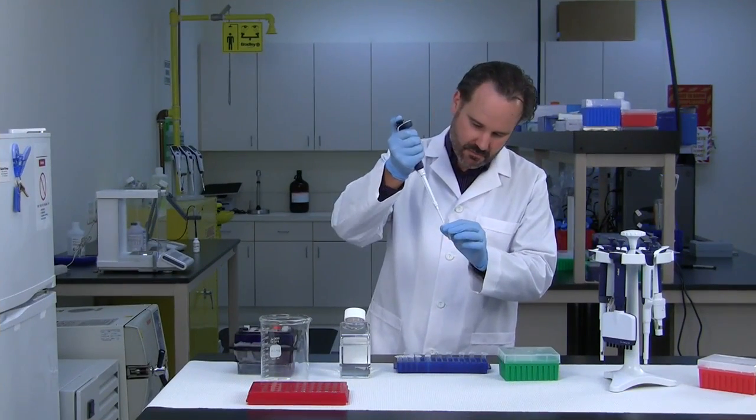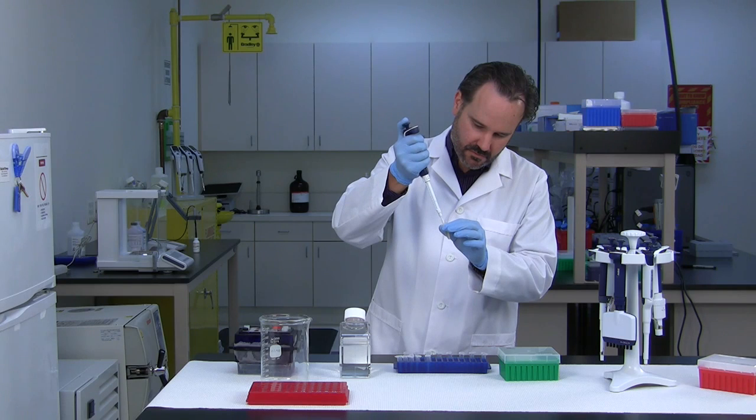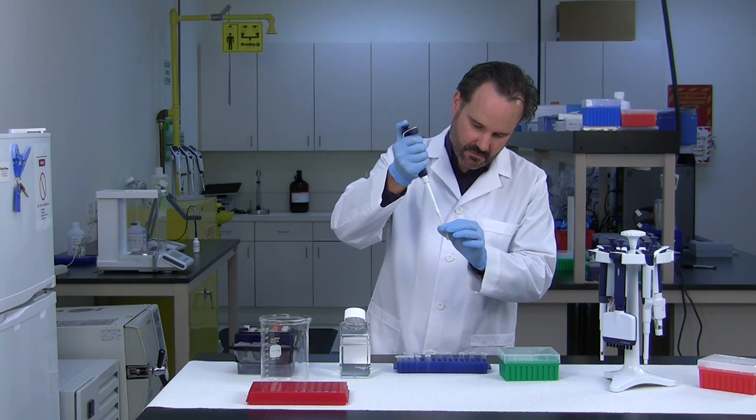If you are concerned about cross-contamination, dispense the sample above the liquid and don't touch off.